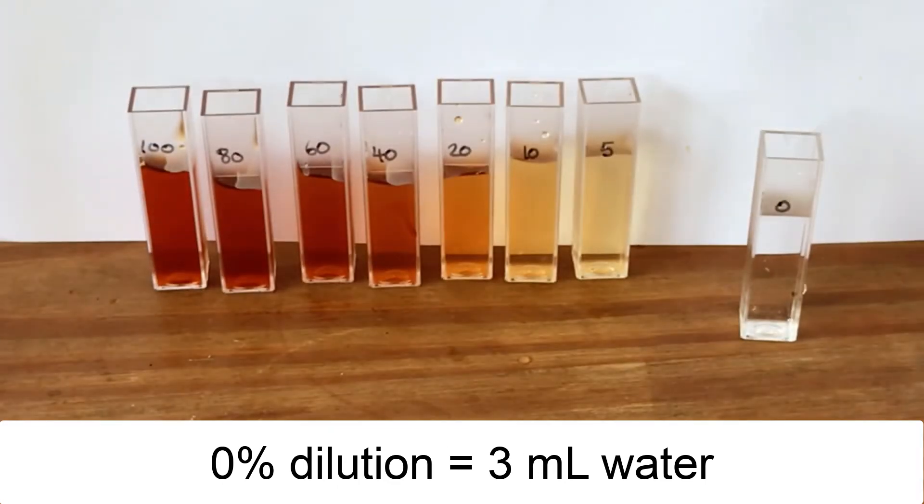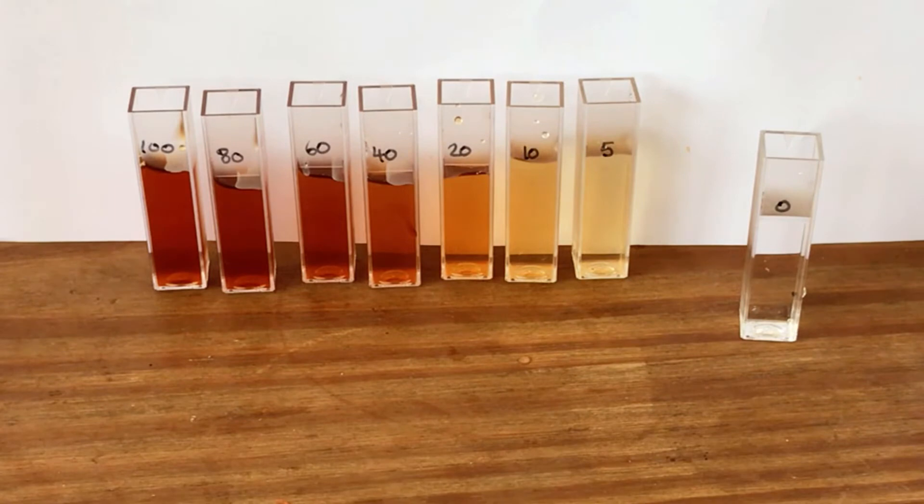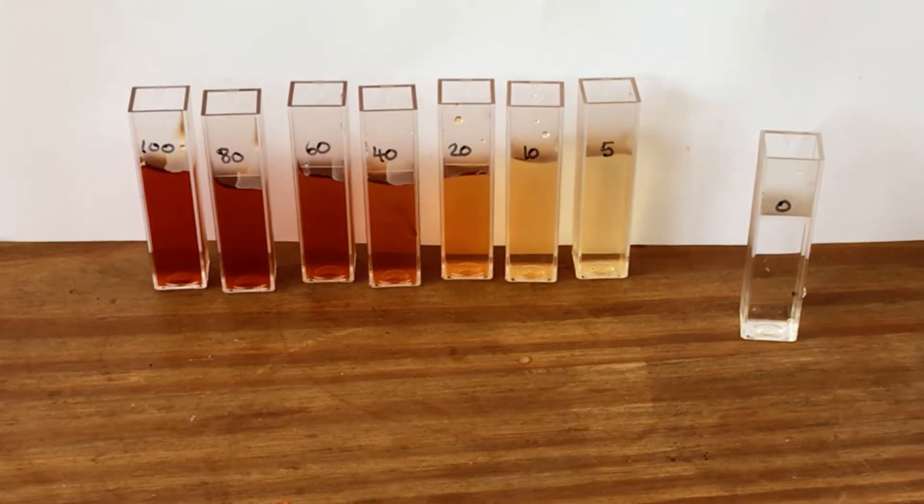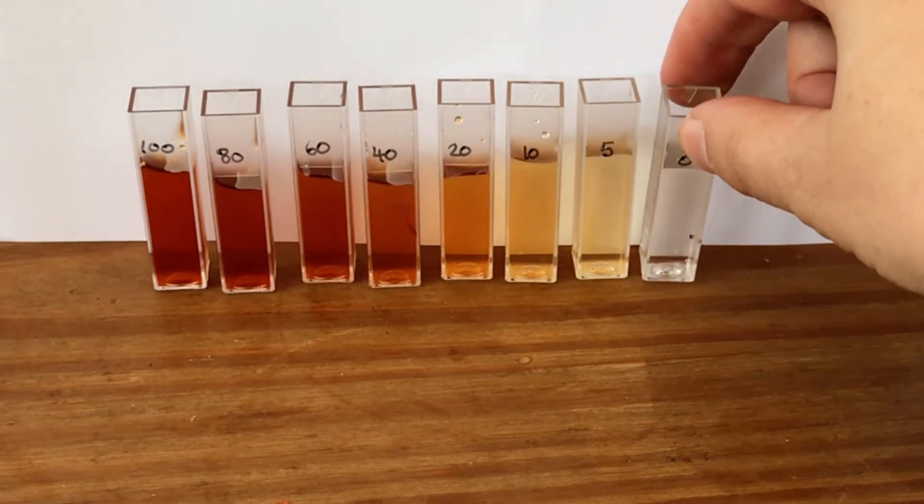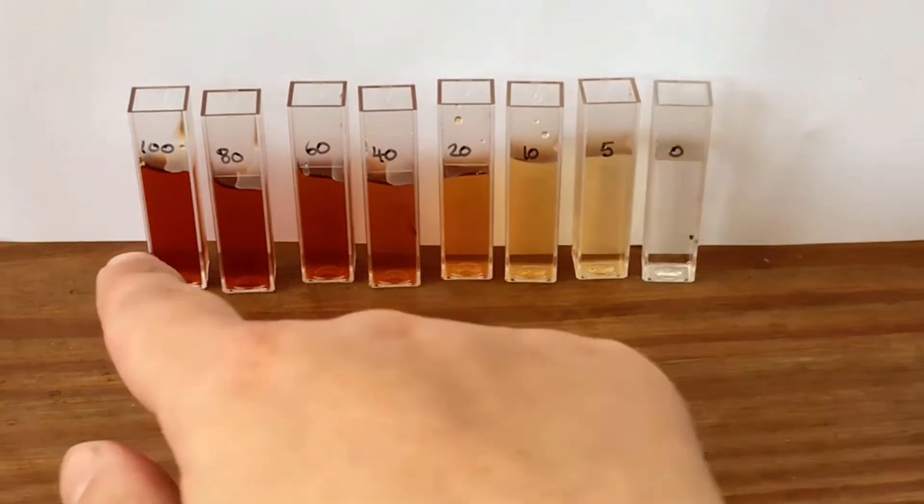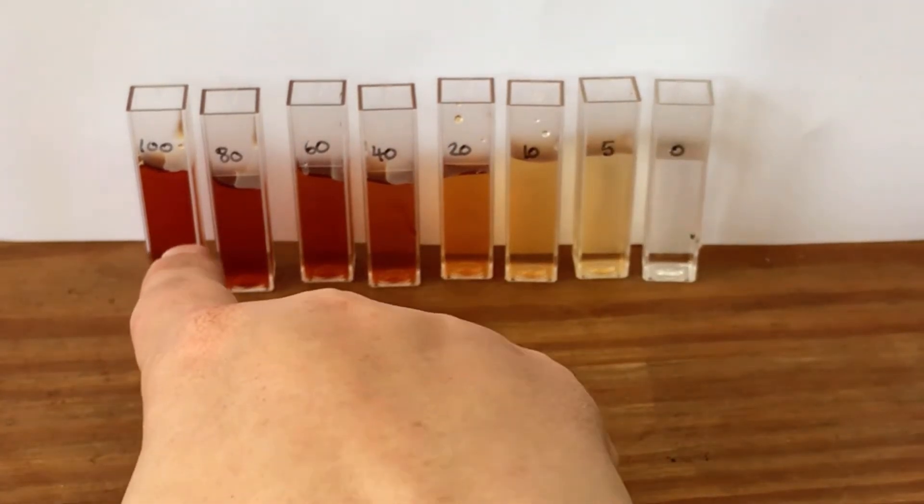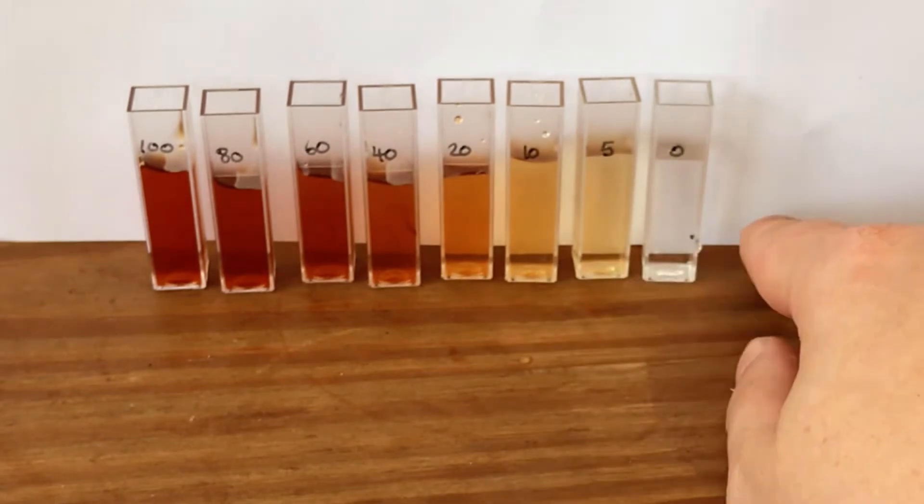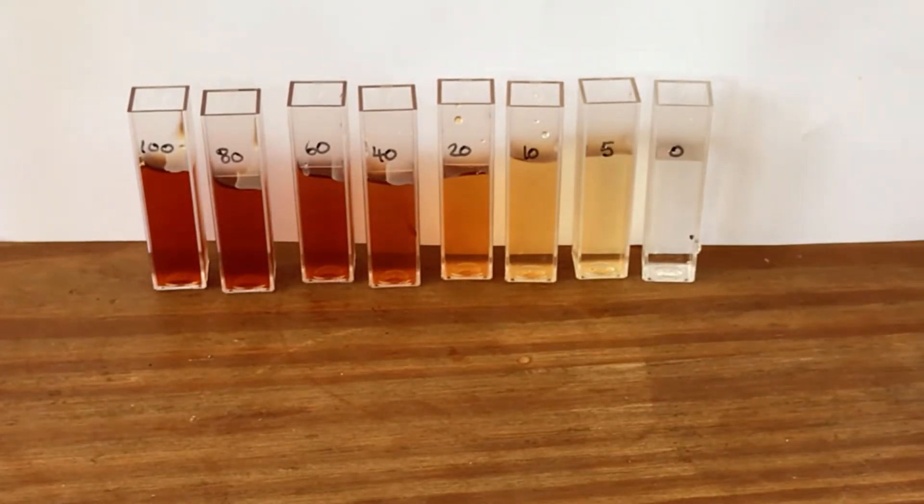So I've now got a dilution series set up of my different strength of tea. You can see we go from the most concentrated which was just the cup of tea itself, and by making up those dilutions I've now got a range of different concentrations of my tea. So I can now go and put those into the colorimeter setup and collect the data on the concentration series.